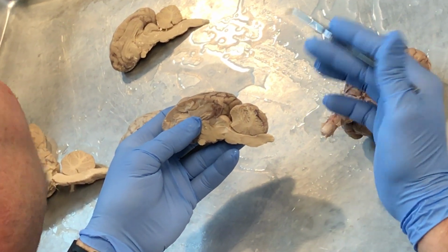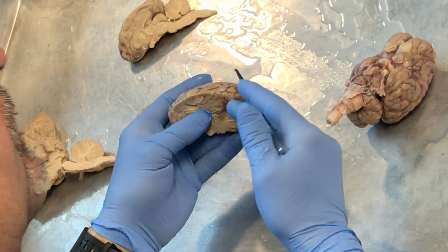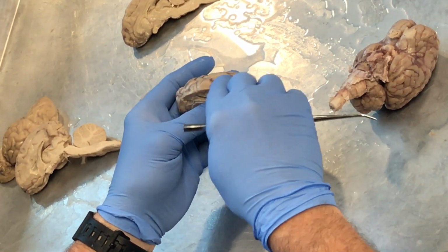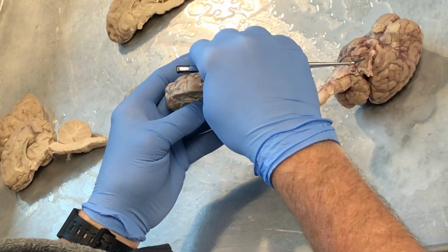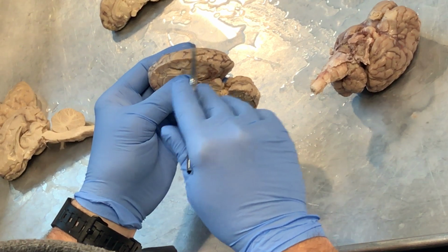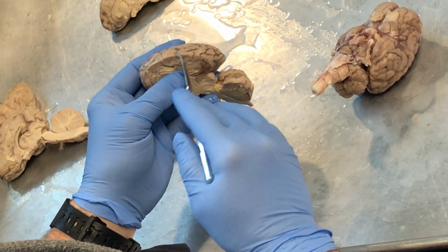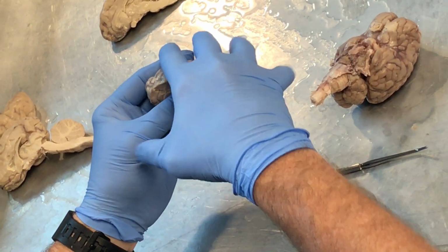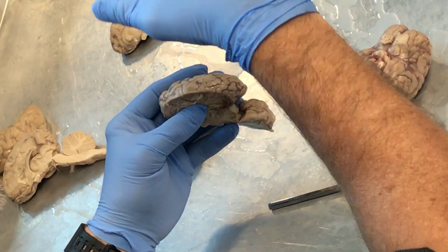Now why is it called the arachnoid layer? I liken this layer to cellophane. If you put cellophane on the surface of this, it's going to go over the surfaces of these little bumps and crevices, but it's not going to go all the way down inside of them, right? What sits underneath this arachnoid layer is cerebrospinal fluid, the fluid that goes around the outside of the brain and spinal cord as well. That cerebrospinal fluid underneath this layer will cause it to tent upward, almost like a balloon.